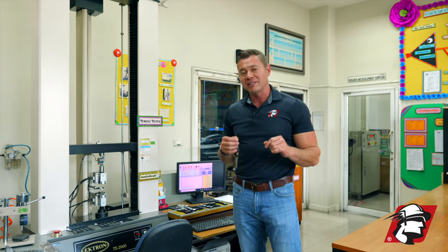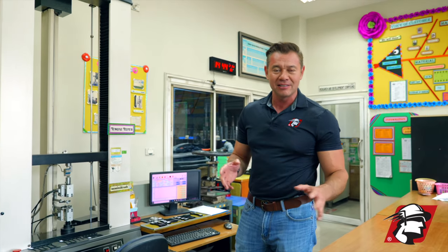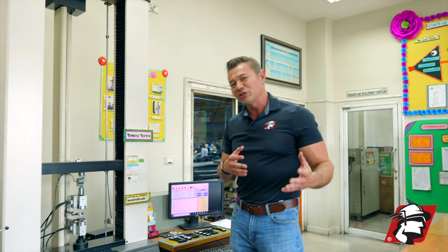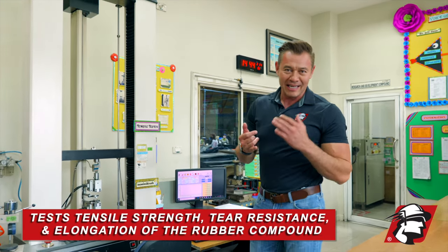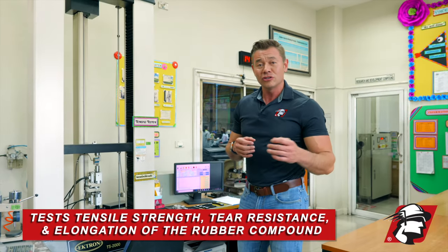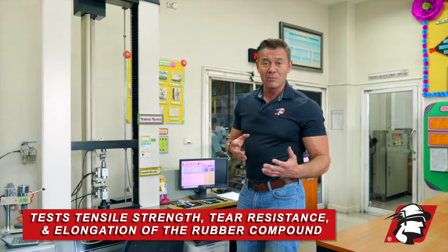I wanted to show you a piece of equipment that we use on a daily basis to monitor the compound. This is what we call a tensile tester. What does this machine do? We test the tensile strength, tear resistance, and also elongation of the rubber compound.